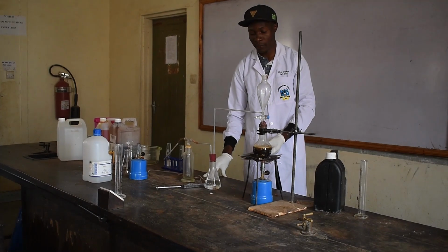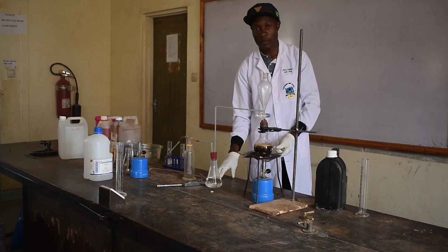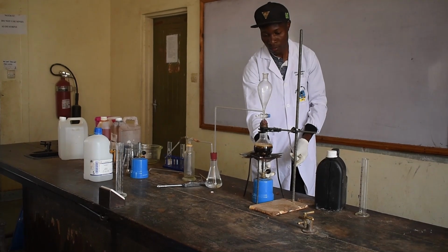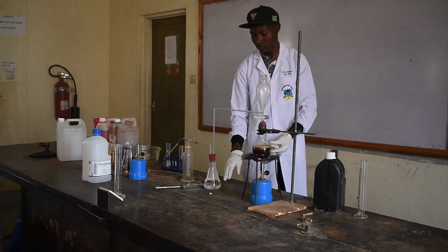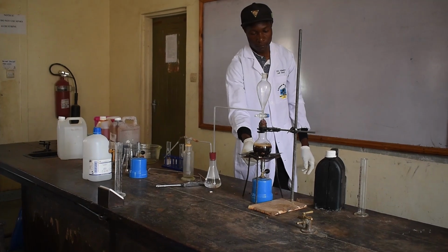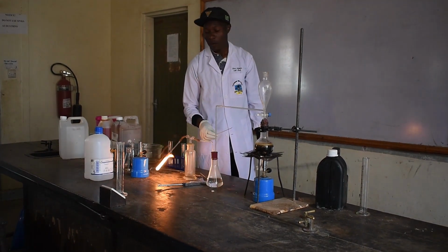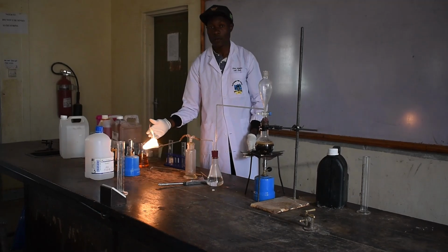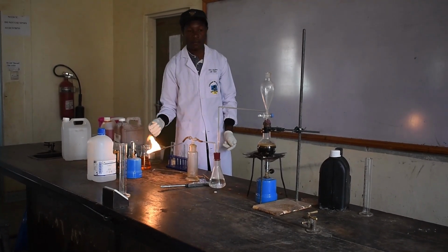The reaction is a bit explosive. The porcelain beads are the ones preventing the bumping of the liquid to avoid breakage of the round bottom flask. As for the production of gas, we can test by igniting. Now this is an indicator that we have produced ethene gas. Ethene gas burns in a yellow, sooty flame. This is an indication that the gas is being produced.